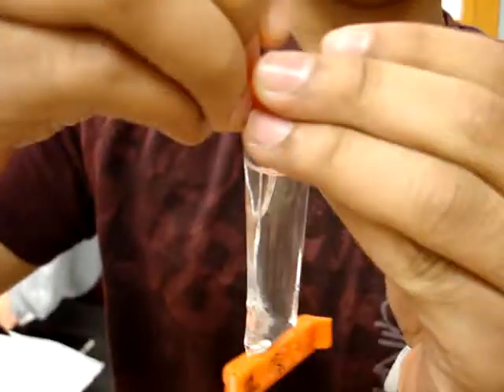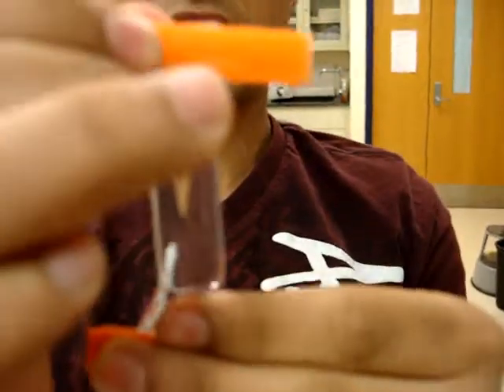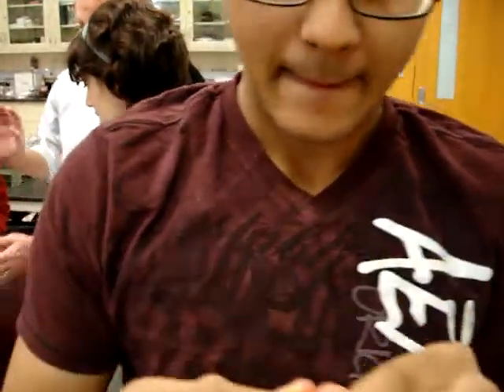Grab a clip — be very careful. Put that in there and there we go.